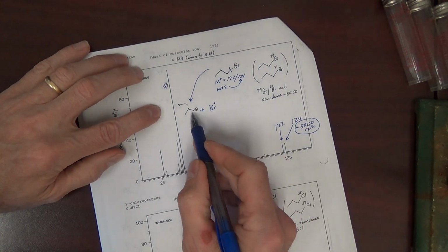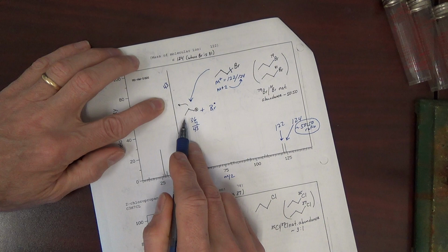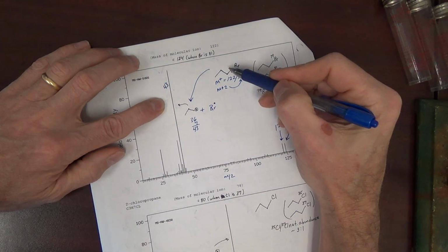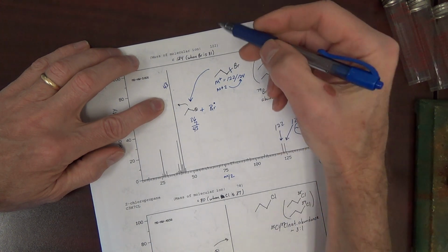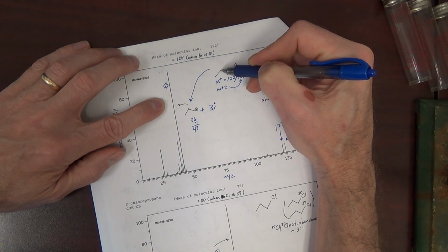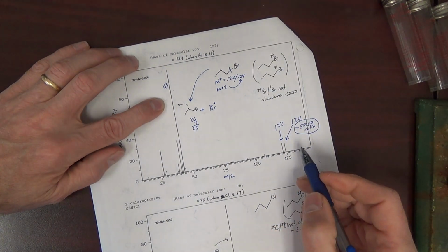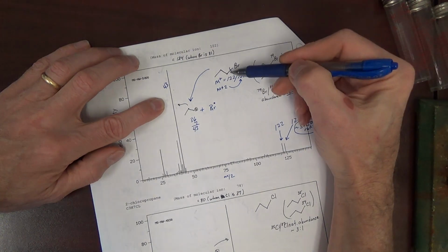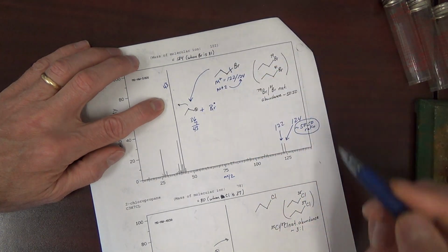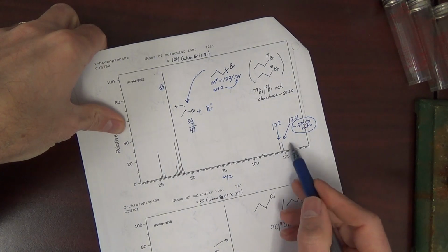Okay, we make this cation. This seems to be the most prominent cleavage right here. It is a primary cation. You know, I reckon this could have cleaved off a hydrogen and made a secondary cation here. That would be just a loss of 1, 121, 123. There actually is a very small amount of 121, 123 here. But it looks like the main cleavage was to give primary cation. Okay. In the end, the isotope pattern that we see here with the bromine is very important here.